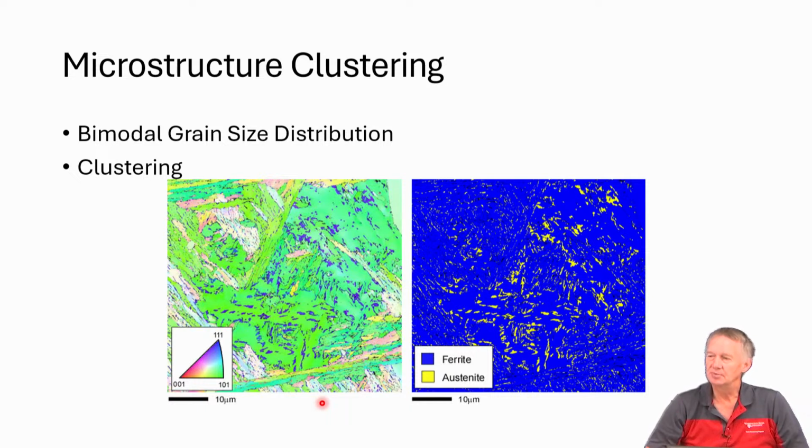So there is a little bit of difference in how patterns are deconvoluted. If I have patterns on top of each other, that's how I deconvolute those patterns. But as far as just comparing FCC and BCC patterns, if the patterns are reasonably good quality, you should be able to get a pretty good determination.